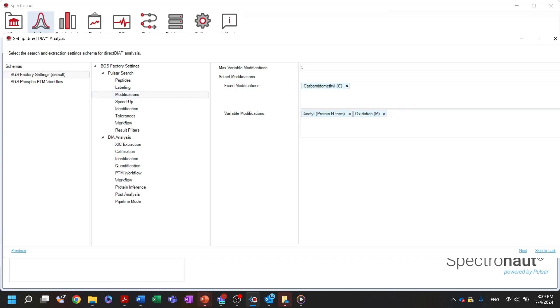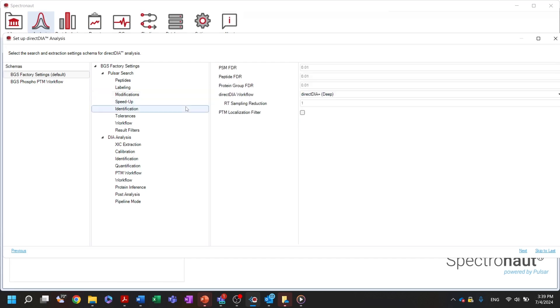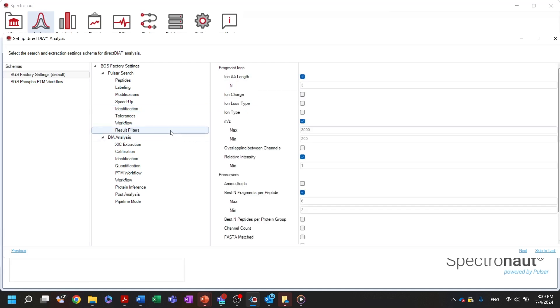The identification section allows us to control reported results using FDR on the PSM, peptide and protein group levels. Result filters determine which of the identified precursors and their corresponding fragments will be used for the peptide-centric part of the analysis. You can find a detailed description of each of the available settings in the software manual.